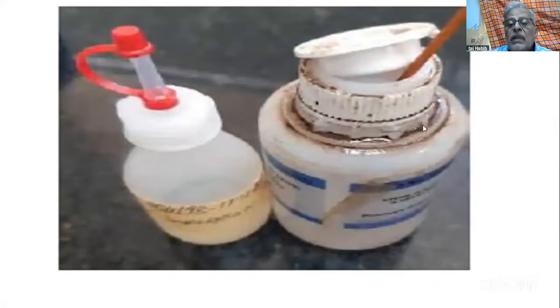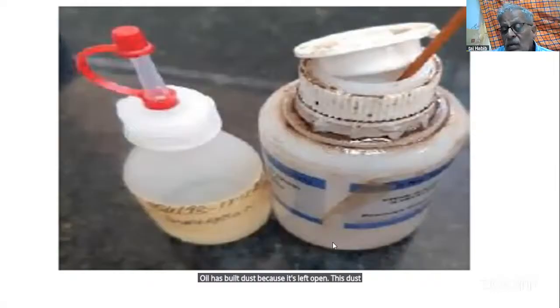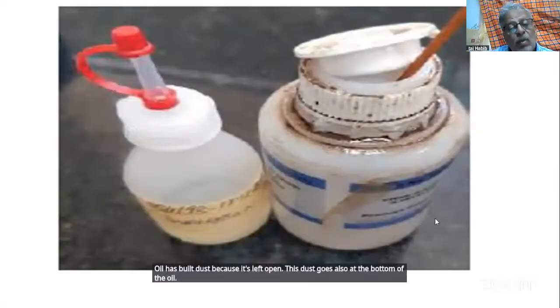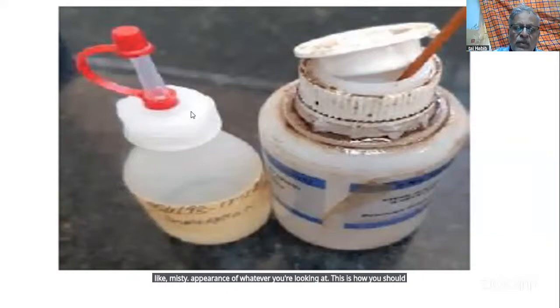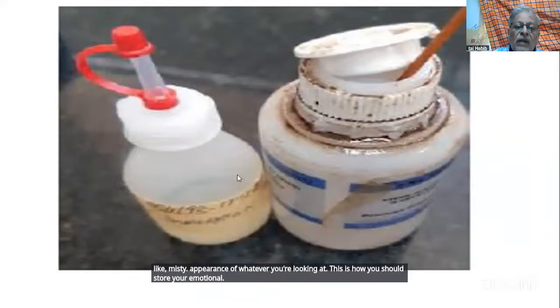Oil has built dust because it's left open. This dust goes also at the bottom of the oil. It also mixes with the oil. So when you use it from this sort of system, you get a very hazy, like misty appearance of whatever you're looking at. This is how you should store your immersion oil. A dropper bottle.